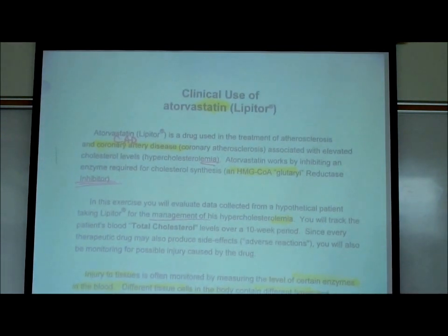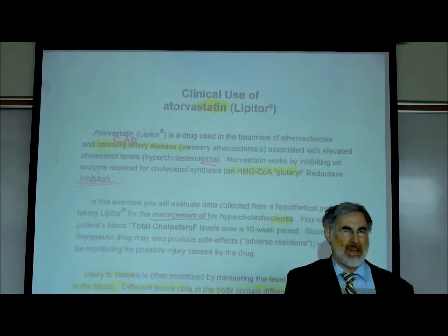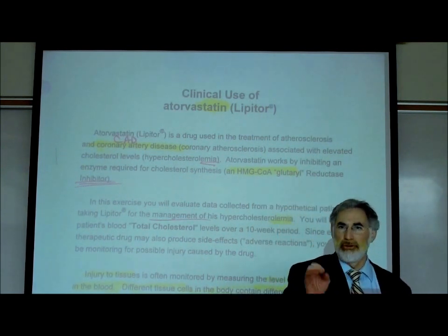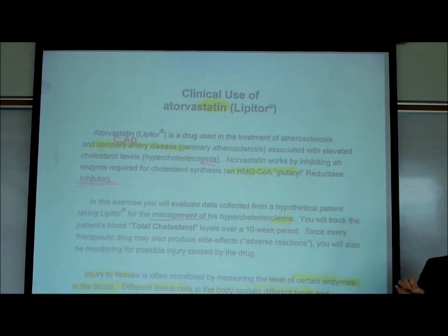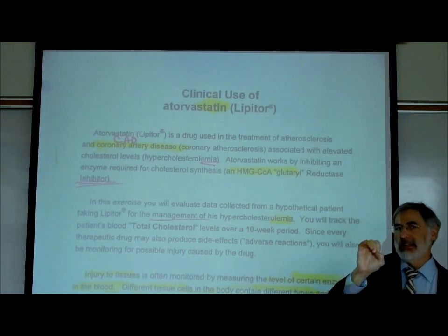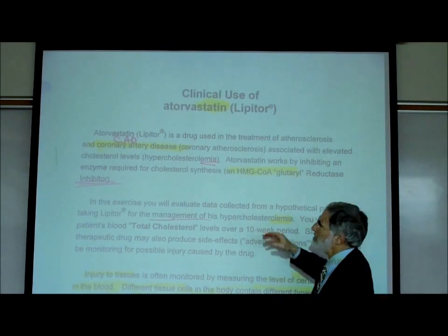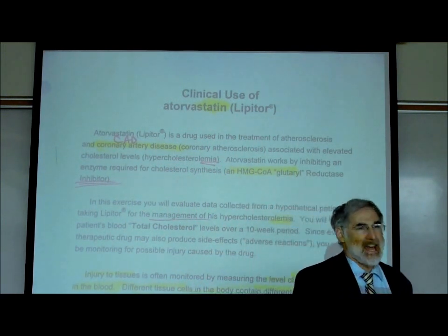So let's walk our way through this handout. Again, you're going to watch that spectrophotometer video, which is about a half hour, and make sure you understand the principles of spectrophotometry and this relationship between light absorbance and concentration of a chemical in solution. Now, I'm using the example of atorvastatin.